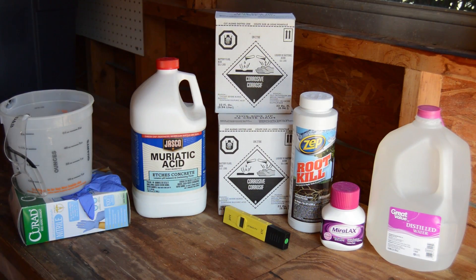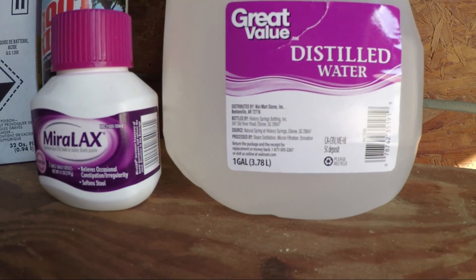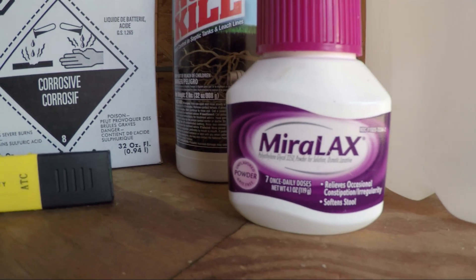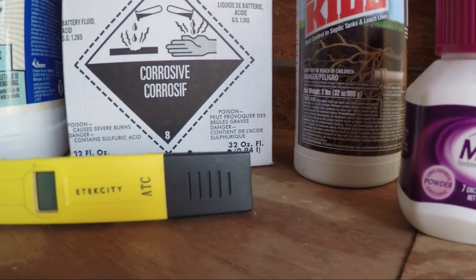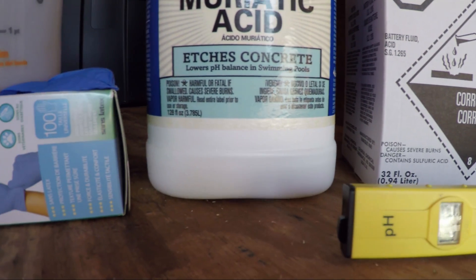Some of the ingredients we'll be using in this experiment are distilled water, Zep root kill, carb battery acid, muriatic acid, and polyethylene glycol — or PEG — also known as laxative.